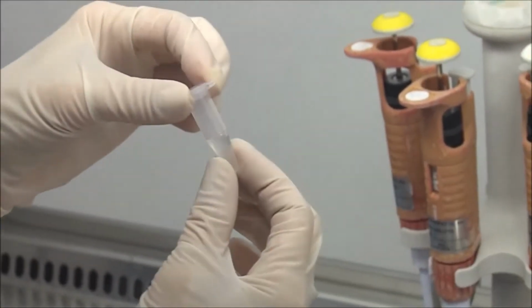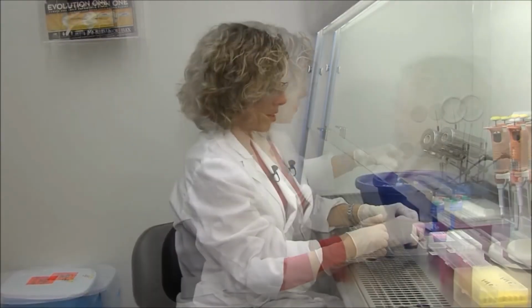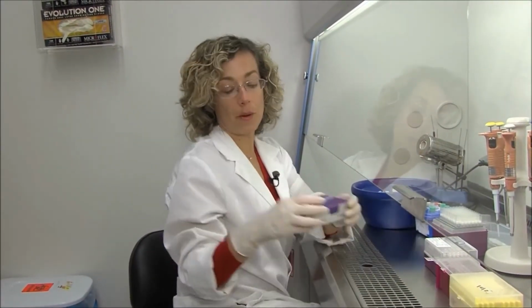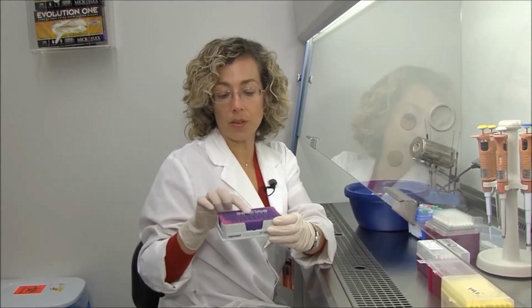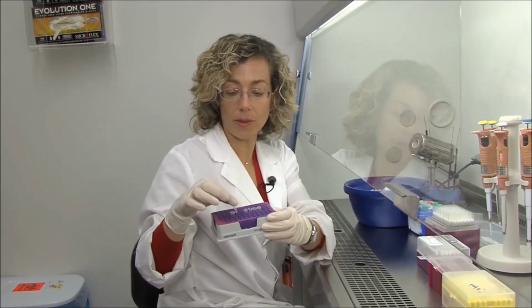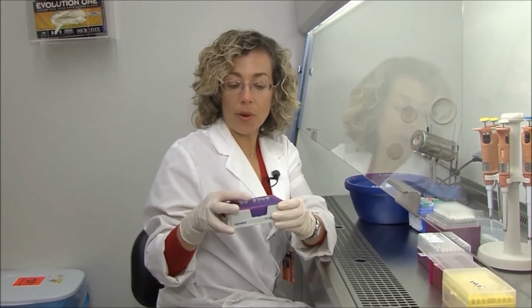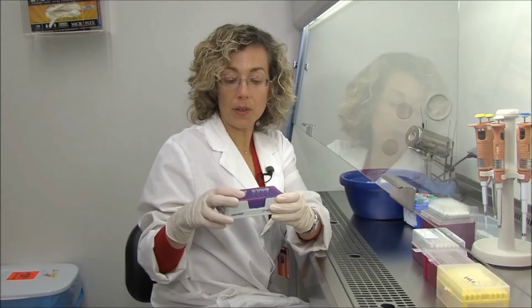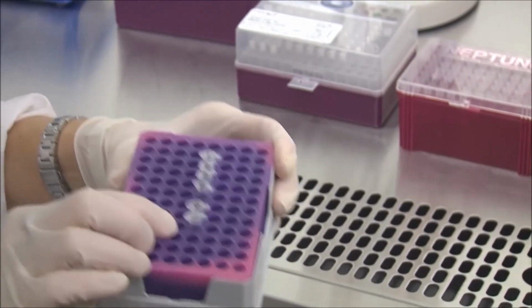So this is our master mix, and now we just have to vortex to make sure all the reagents are well mixed, and then we'll aliquot into our PCR tubes. So we are gonna aliquot our master mix into our PCR tubes. Today we have 4 samples, our positive control tube and our negative control tube. Both controls are very important. In PCR, you want to make sure that you have a positive control and a negative control.